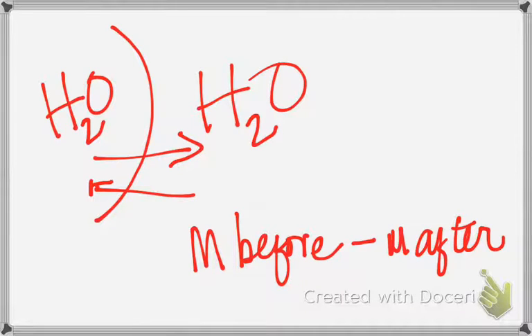And what were you calculating on your data tables? Difference in masses and percent change. That will tell you whether something entered the egg or left the egg. Now, what that something is, do you know what it was? If it's osmosis, it's water. But do you know? Do we have a way to test that?